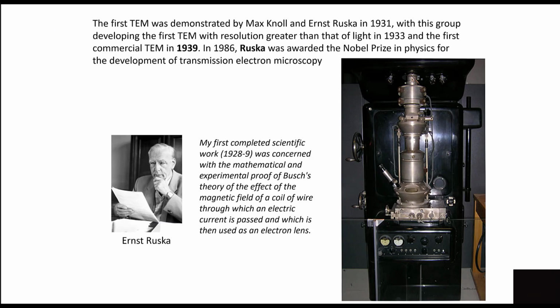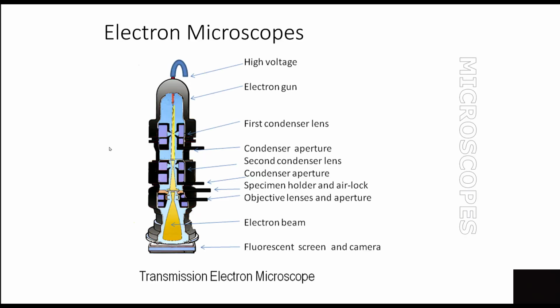Now, it was developed in the 30s. The old Ruska electron microscope, the transmission scope, NC State actually had some of those. I worked on one of the originals. You would take a rubber mallet and hit various parts of the stage where the magnets are to align it. It sounds a little crude, but today we just use magnets that we apply voltage to adjust the transmission of the electrons through the path there, and then you can align it and get it through your sample right about here, which is held in a gold grid, and then the image and camera is set up.